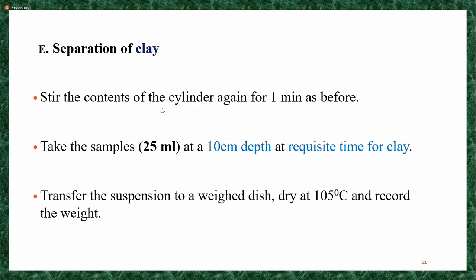By field method we can analyze the texture for so many samples, but for the time consuming nature we can't conduct this experiment for so many samples. You have to remember that point. That is one of the demerits of this experiment. Now let's see the procedure for separation of clay.